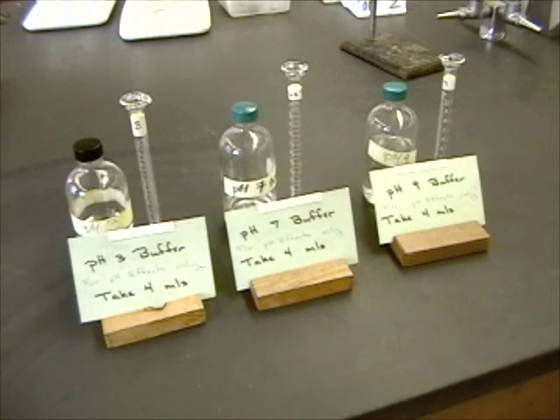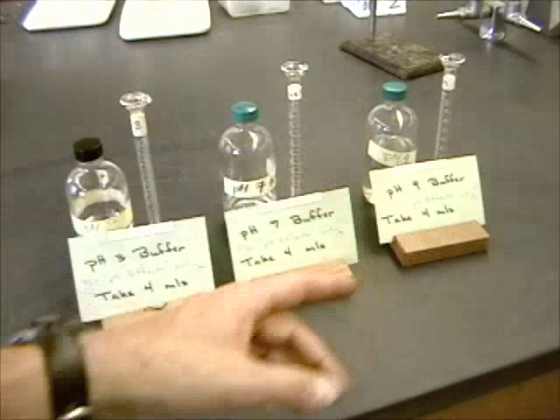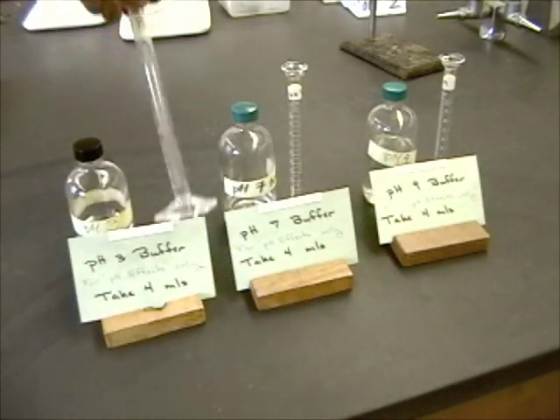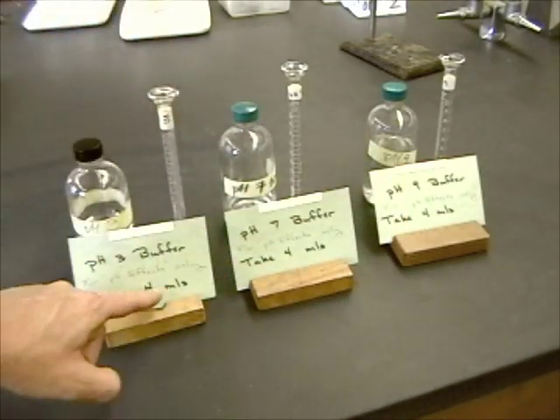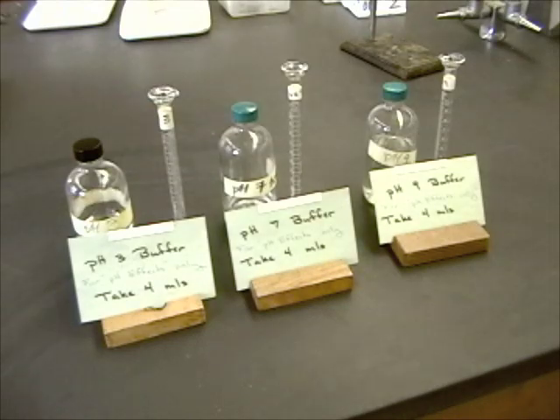The reagents for the pH experiment are stored on the other side of the lab, but it's the same sort of thing. For each of the different pH buffers, there's a dedicated graduated cylinder and a little sign telling you exactly how much you're going to need to complete your experiment.